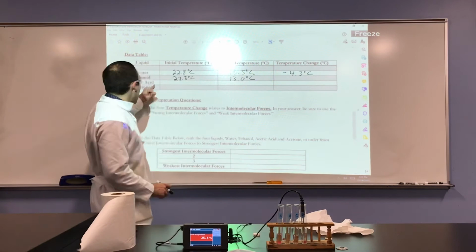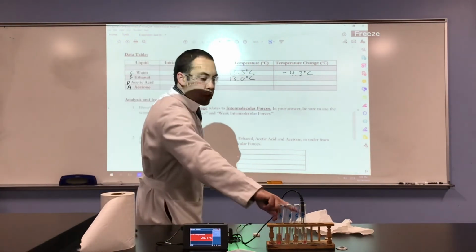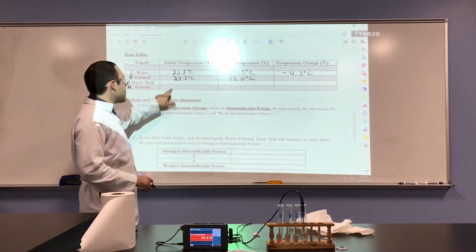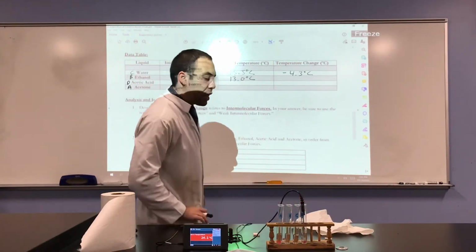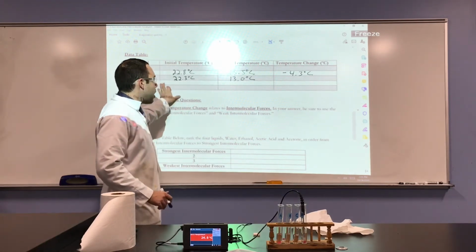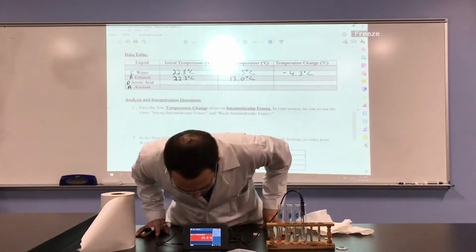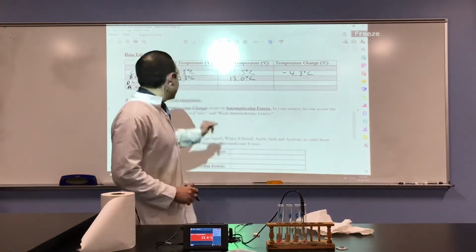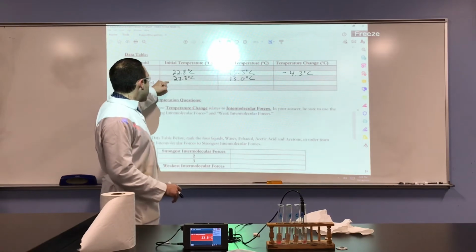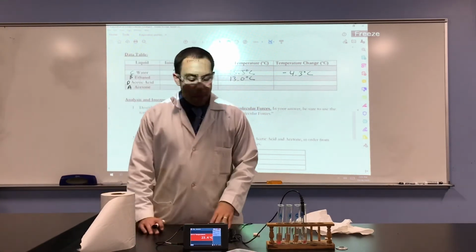Now, if you're watching at home, please make note that the acetic acid is in test tube D, and the acetone is in test tube letter A. So please make that change. It should not affect your results, but we do want to have everything correct. So we're at 23.8, probably should get somewhere between 22.8 and 22.3. That seems to be the room temperature right now.